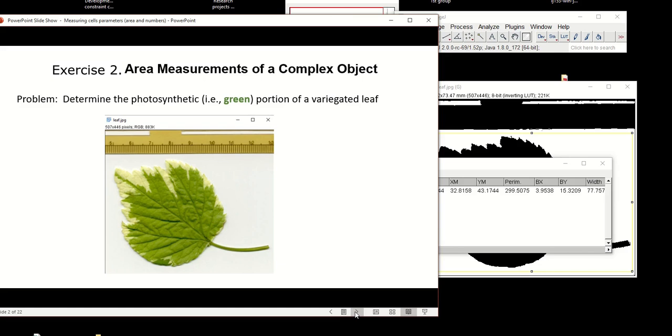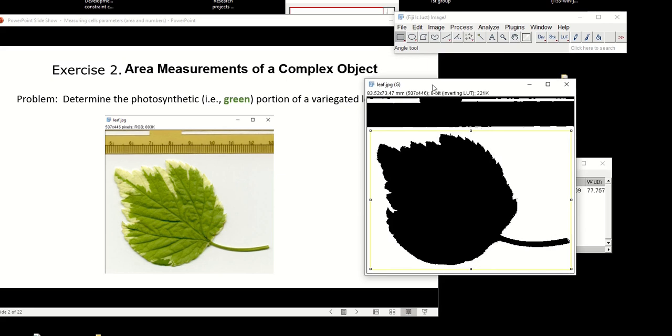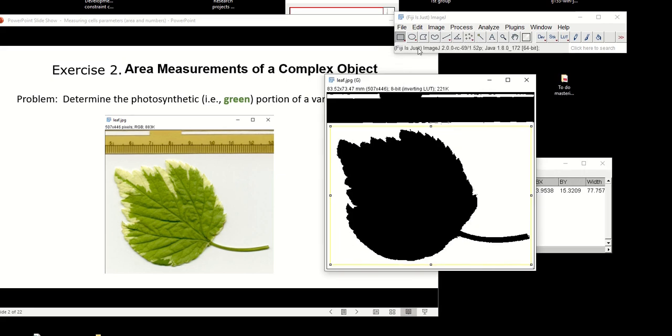Okay, in this second exercise, we're going to do something different. In the previous one, I showed you that sometimes these images are very difficult to measure when they have irregular shapes. Last time we just did a binary conversion, and in that way sometimes the software automatically judged that this was what you need and this one, and you didn't need, for example, this part. However, you can do it more gradually and make sure that it's counting exactly what you want.